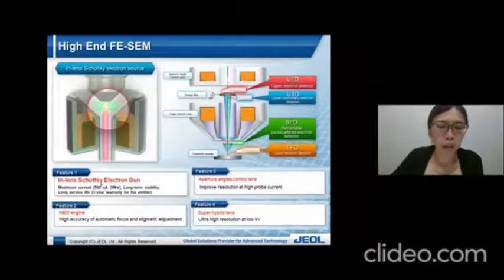This is 10 times larger than the conventional SEM. It results in the greatest brightness and intensity. The electron gun has a long-term stability with less than 1% fluctuations. This is good if we are running a long process time analysis. Also, because all the electrons are fully utilized here, the electron gun has a long lifetime with a 3 year warranty. In practice, our electron gun can be used for longer, even more than 5 years.